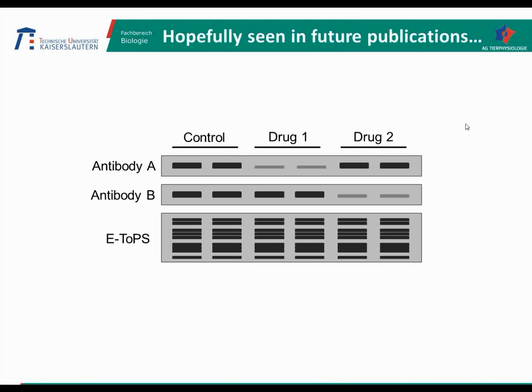Okay, so then hopefully, to come back to this slide, future publications look somehow like this, that you don't have a loading control which is a housekeeping protein, but one which is a total protein staining.